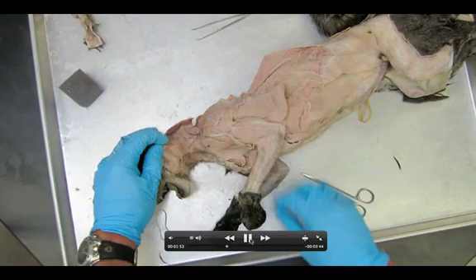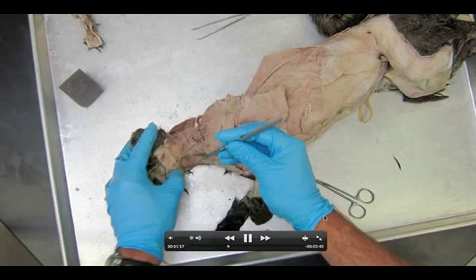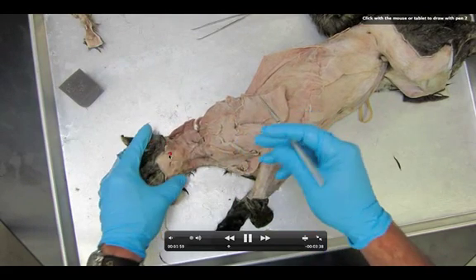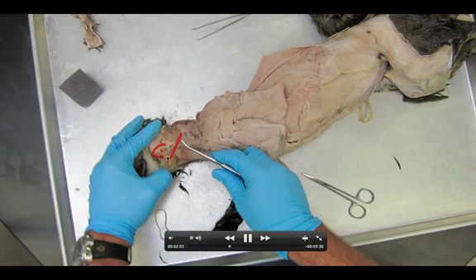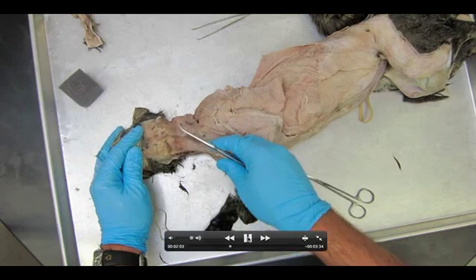Now let's take a quick survey of what we're looking for. The first muscle that we need to find is the masseter, which you're going to find right here on the jaw. If you can find the masseter, everything else should fall into place. So find the masseter first — this is the muscle you use to chew your food with.